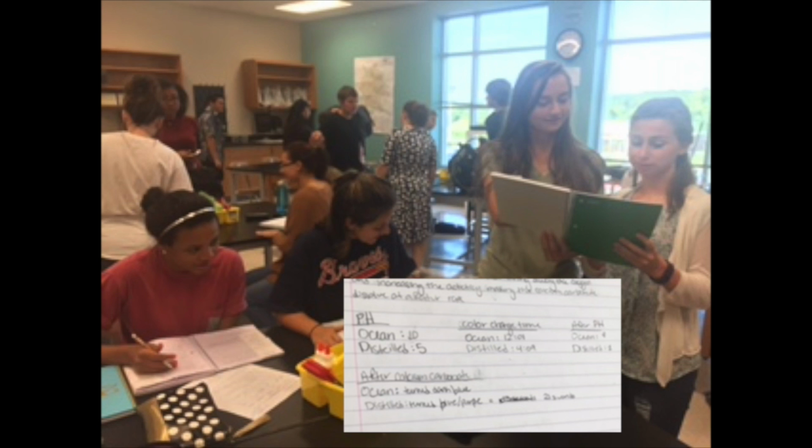There was also a difference in our findings. While our group's ocean water changed to green and distilled water changed to orange after adding in the calcium carbonate, or chalk, their group's ocean water changed to dark blue and their distilled water changed to a bluish purple color.